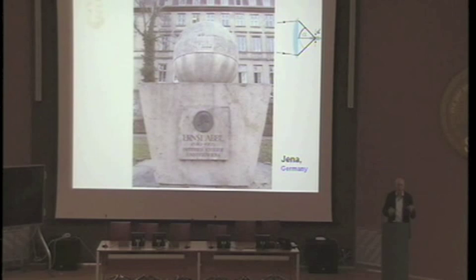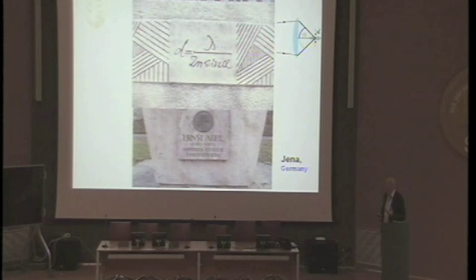Well, the subject is very simple. I think we all know that the resolution of a light microscope, at least that's what we've been told at school, is fundamentally limited by diffraction. Now, at the end of the 19th century, this man that you can see here realized that the resolution of a light microscope is limited to a value which is given by the wavelength divided by twice the numerical aperture of the objective lens. What does this mean?